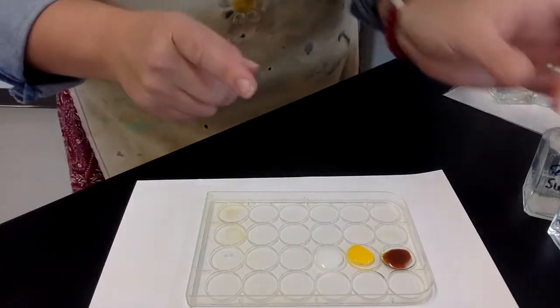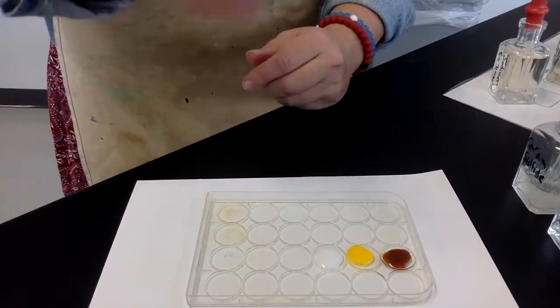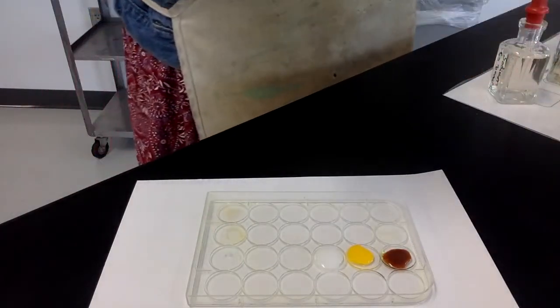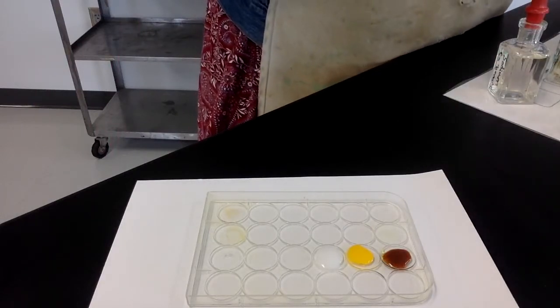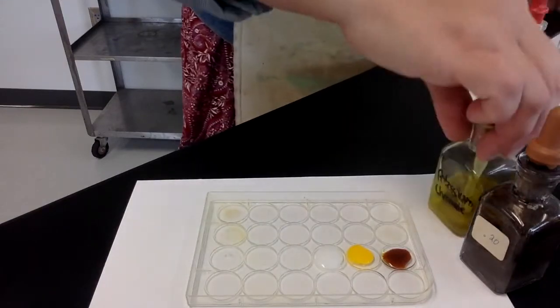So lead 2 nitrate and sodium sulfide mix, they form something new, a precipitate. Describe the precipitate, you'll write out the 4 ions, and then figure out what the new compounds are. All right, okay, we're on number 4. This one is silver nitrate and potassium chromate.